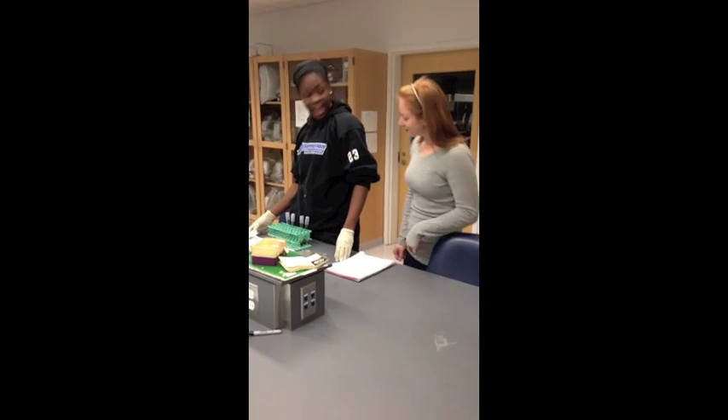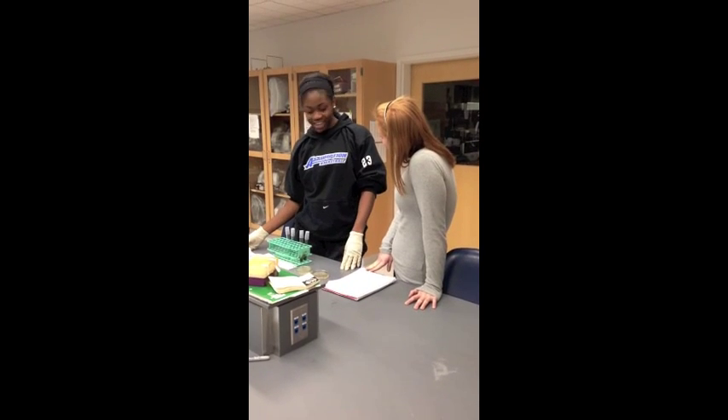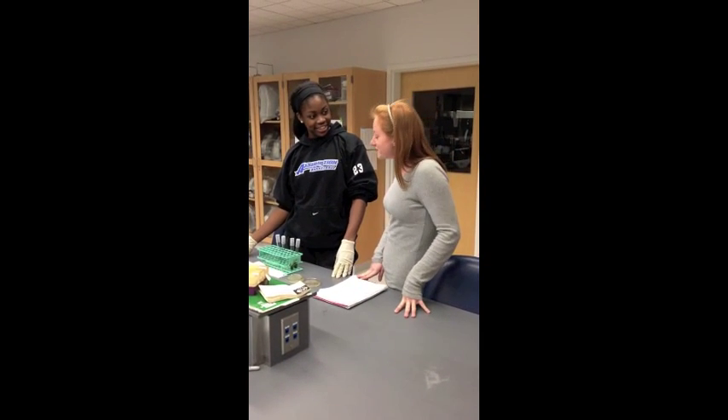Emory, what are you doing? Hey Cora, I'm studying Microbiology and today we're performing the Simmons Citrate Test. Why don't you tell me more about that? That sounds so interesting.